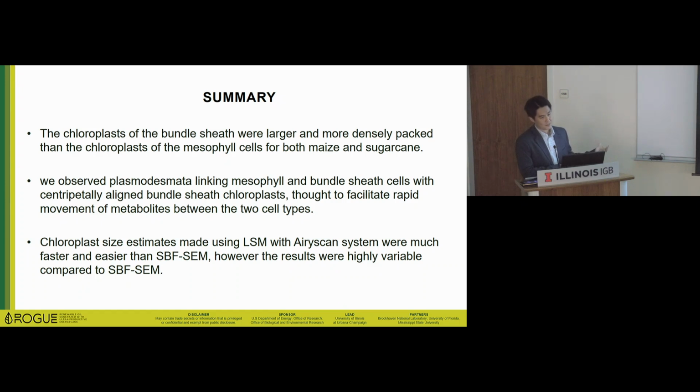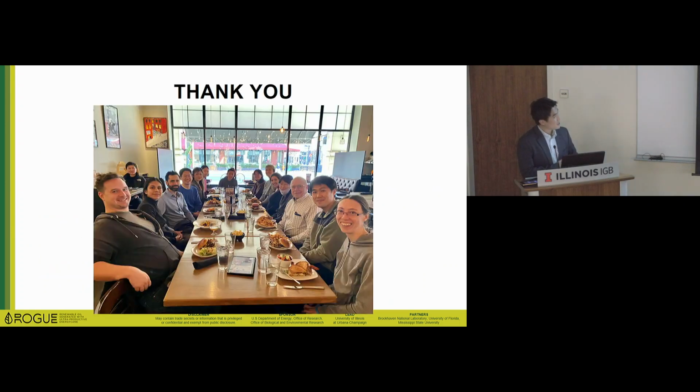But in the case of SBF-SEM, you need to spend 7 days on sample preparation and segmentation. I cannot say it takes such a long time, so there are some pros and cons. When you do your experiment, you can choose which microscope works for your research. That's it, that's all of my research presentation. Thank you for your attention.